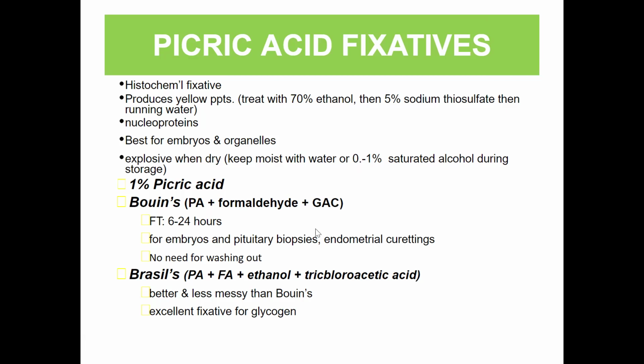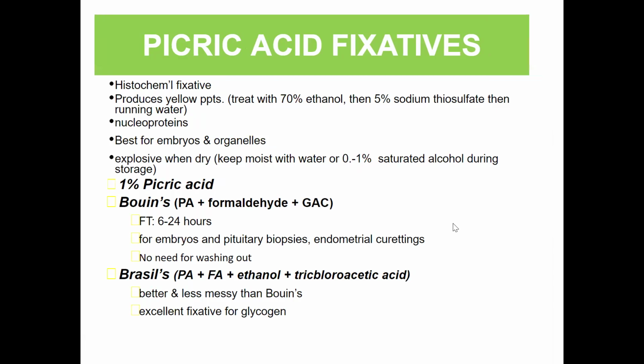Next is your Brasil's. This is a combination of picric acid, formalin, ethanol, and trichloroacetic acid. So this is better and less messy compared to Bouin's and an excellent fixative for your glycogen.